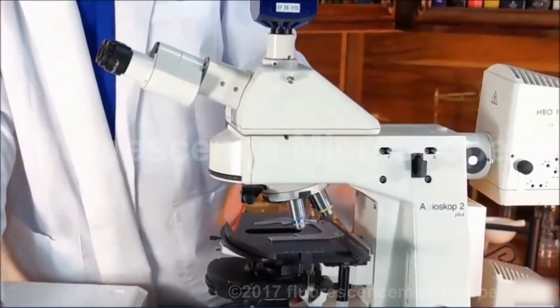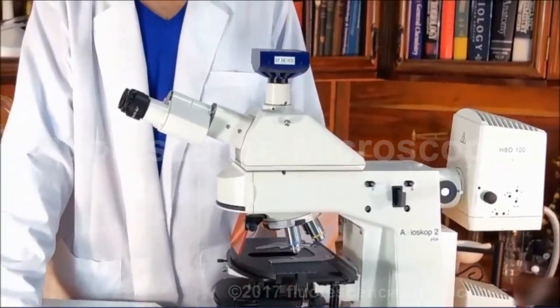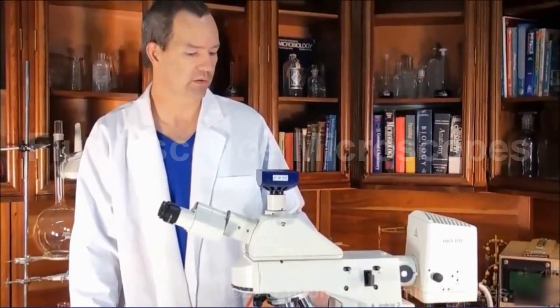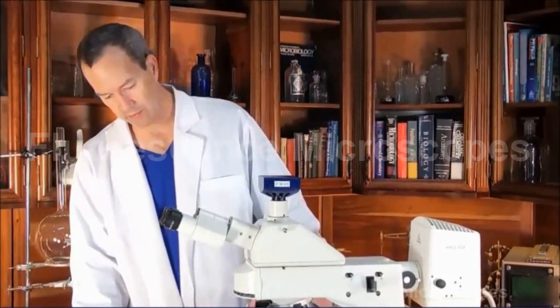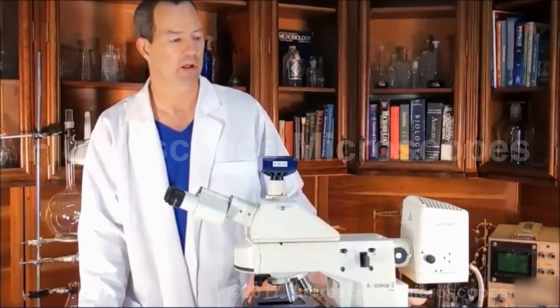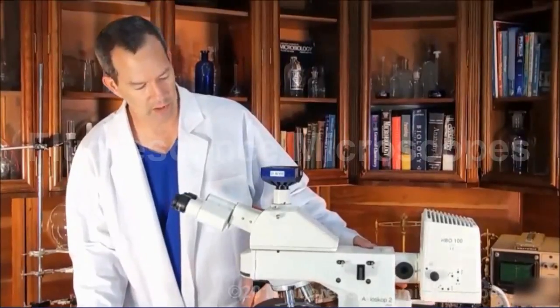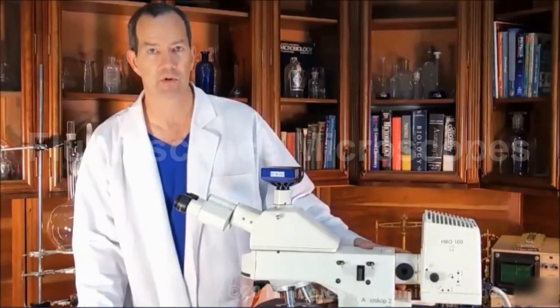Again, this is a Zeiss Axioscope 2 upright fluorescence microscope set up for bright field, dark field, phase contrast, and fluorescence microscopy. If you like this microscope or if you'd like to change any features about it, please contact us. We've got a wide variety of this type of equipment. Thank you.